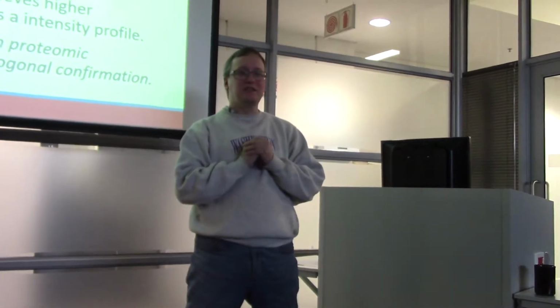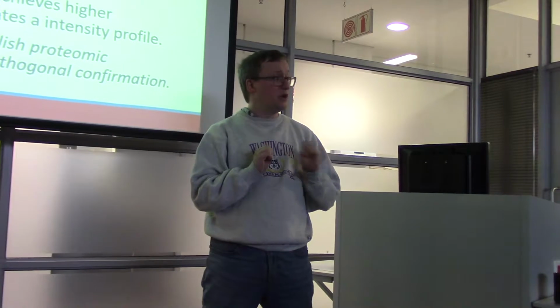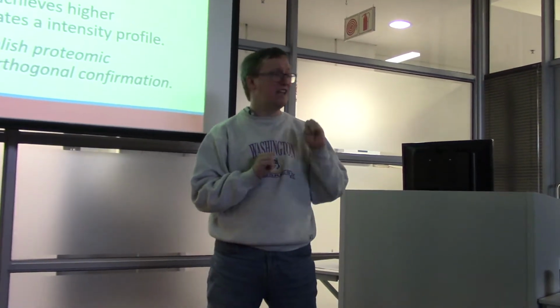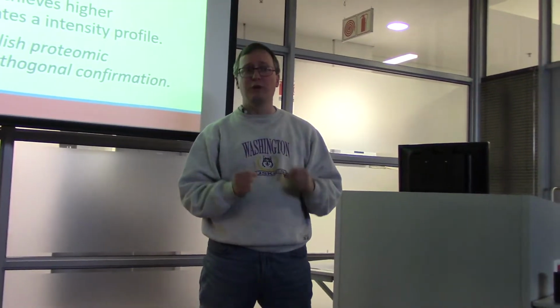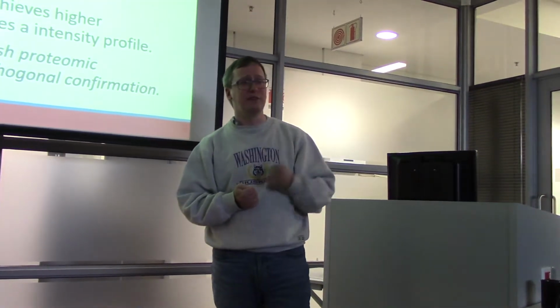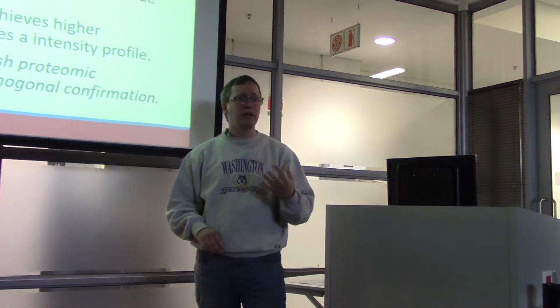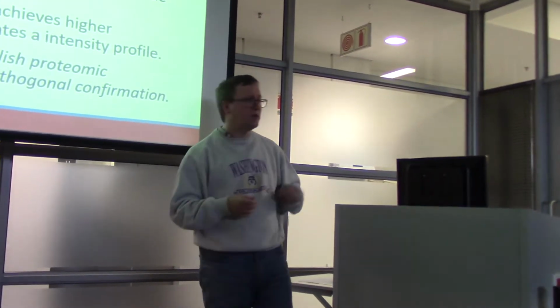I'm sad to say, we have found through bitter experience in the proteomics community that just performing a shotgun experiment is not enough for nailing down which proteins really change. We really need another round of experiments to confirm these differences. And for that, a targeted experiment is a very good way to go about confirming a difference that you found in a shotgun method.